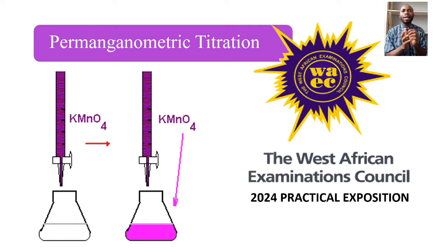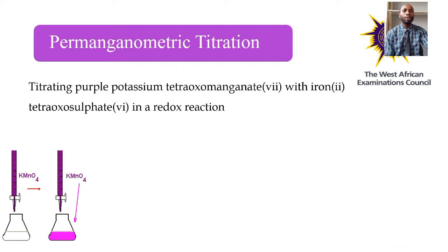This is called permanganometric titration, or some people call it permanganate titration. Any of them you use is correct. So that is what we are expecting to see in our WAEC Practical 2024. So for teachers, that is the first set I am dealing with.